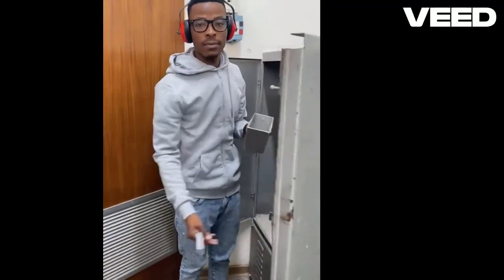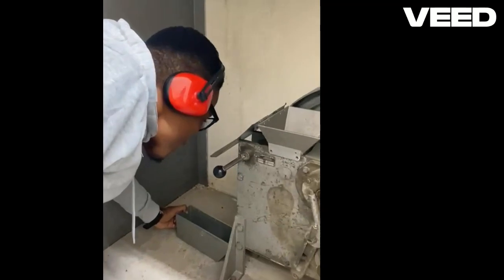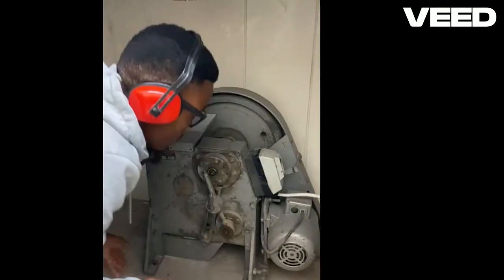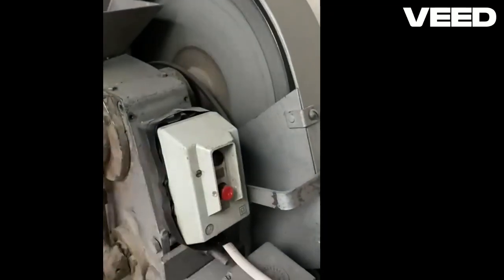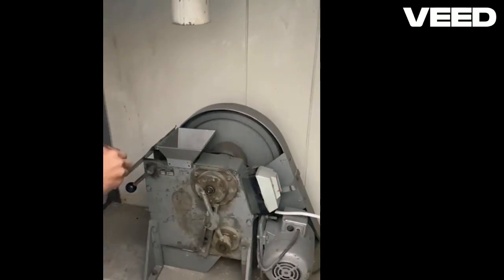Crushing is the initial stage of comminution and involves breaking large chunks of material into smaller pieces. It is usually accomplished using mechanical equipment such as jaw crushers, gyratory crushers, or impact crushers. First step is switching the crusher on. After turning the crusher on, it produces a light sound to show no sample is inside.